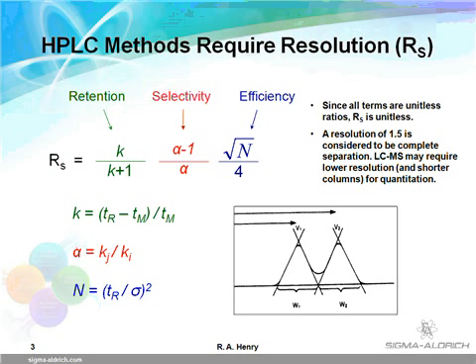Most textbooks recommend that all peaks of interest be retained with a k of 1 or greater for reliable quantitation. A k of 2 to 3 is much safer if it can be achieved. A k of more than 10 does little to improve resolution, and it increases analysis time and dilutes the sample to make it harder to detect.